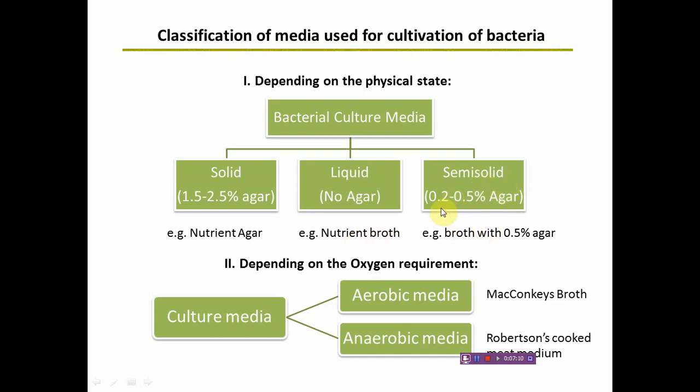Semi-solid media contain a very little quantity of agar, that is 0.2 to 0.5% of agar. So broth with a very little quantity of agar, 0.5%, is an example of a semi-solid medium.